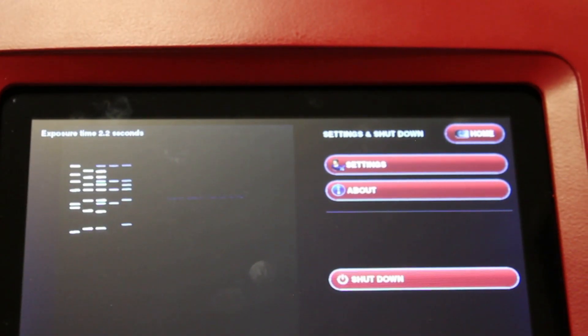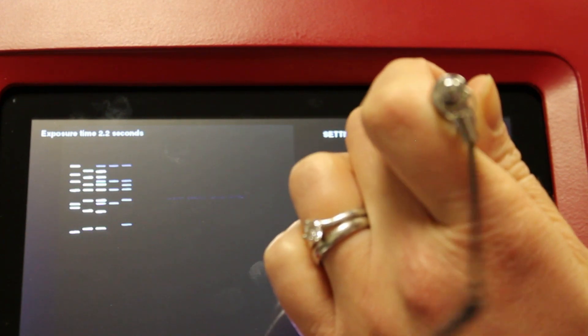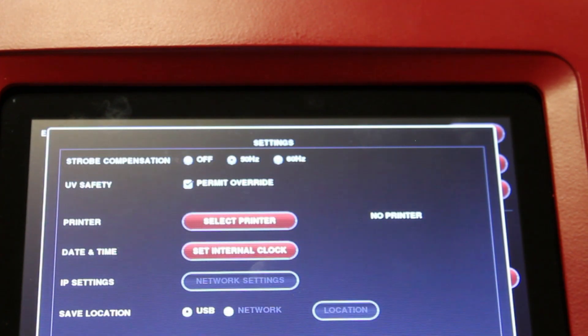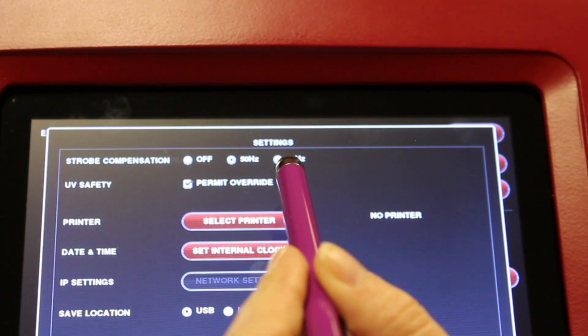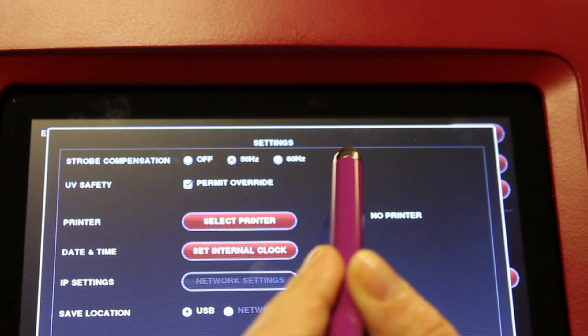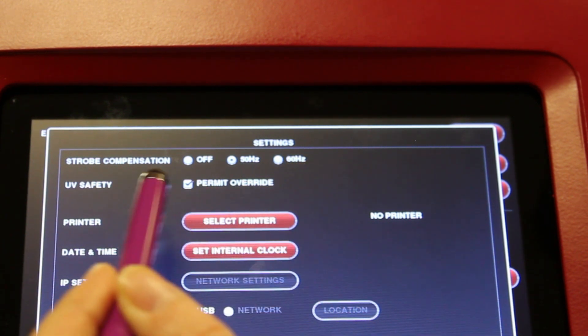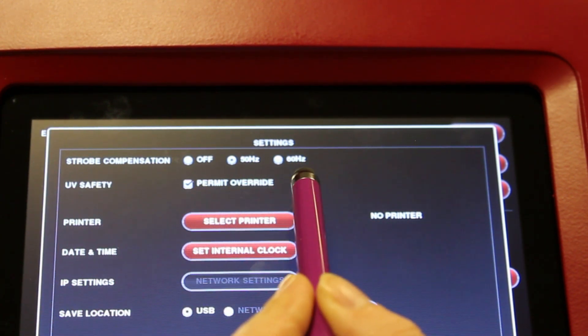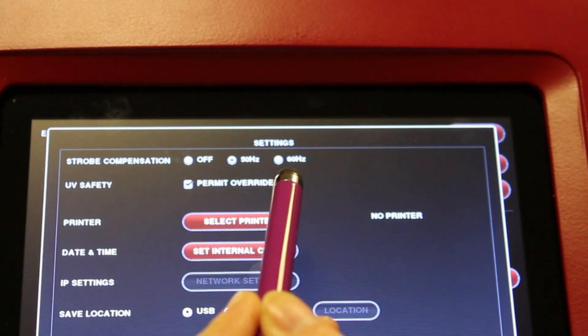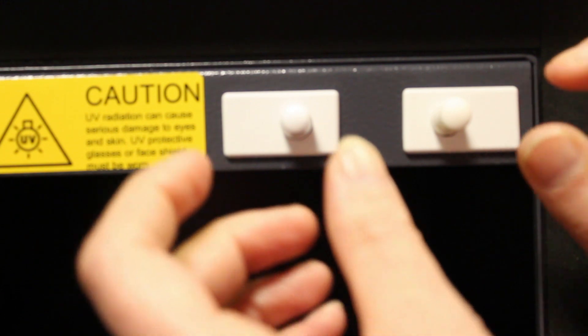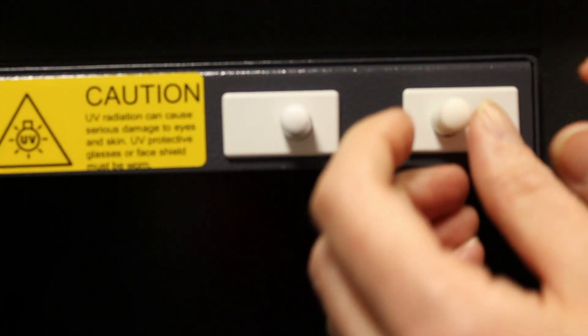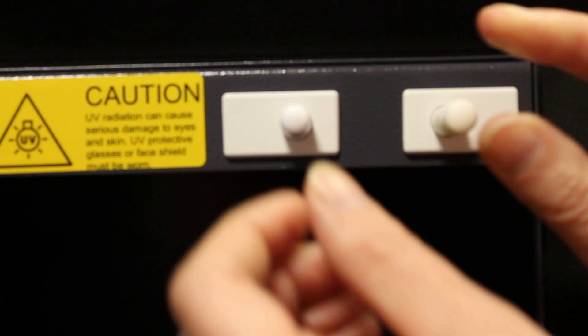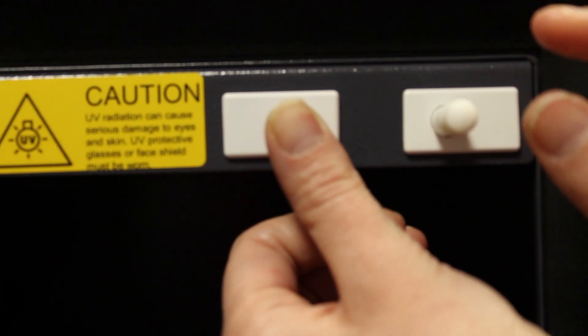To access the settings for the Neugenius system, press the settings button. It should bring up a pop-up window. You can change the strobe compensation from 50 to 60 hertz depending on which region of the world you're in. You can also override the UV so that you can cut out bands. You can override the UV by the software, but also manually by pulling out this button here and pressing that one in.